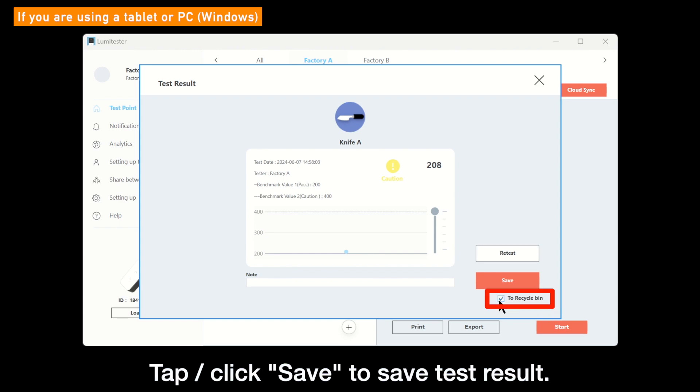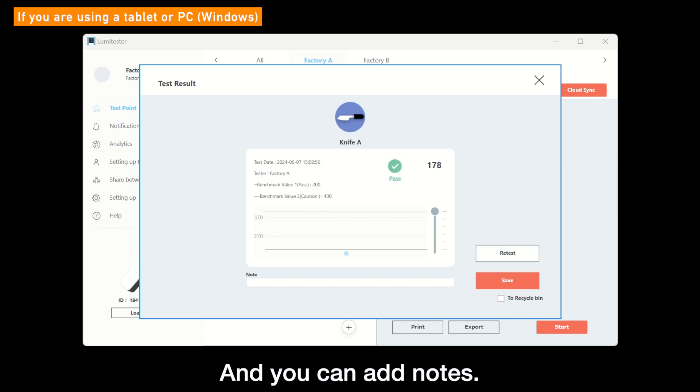Click the Save button to save the result. Also, you can check the To Recycle Bin checkbox and click the Save button to delete this result. Add remarks in the note for each test result. Information in the note can be edited anytime from the sheet All Data of the Analytics screen.